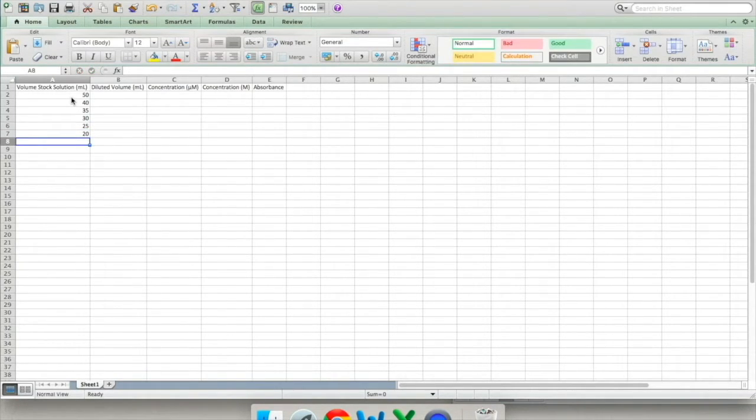When a column is filled, click the top of the next column and continue with the rest of the needed data. Essentially, you need to put the data you have in a table into Excel, so we can take advantage of Excel's features to manipulate the data.